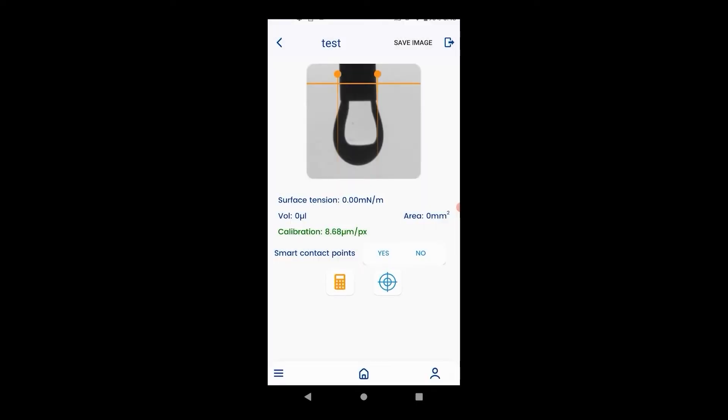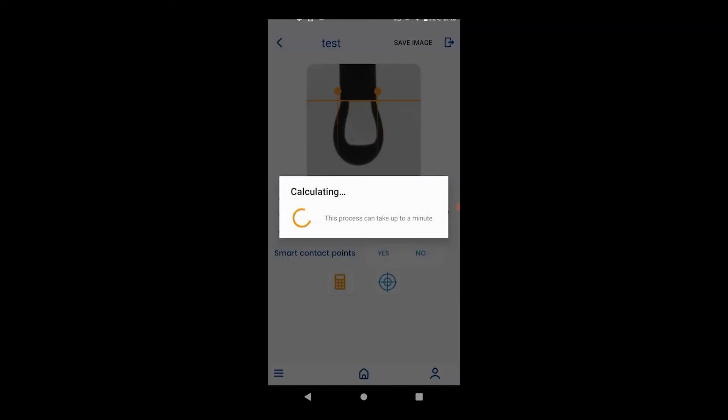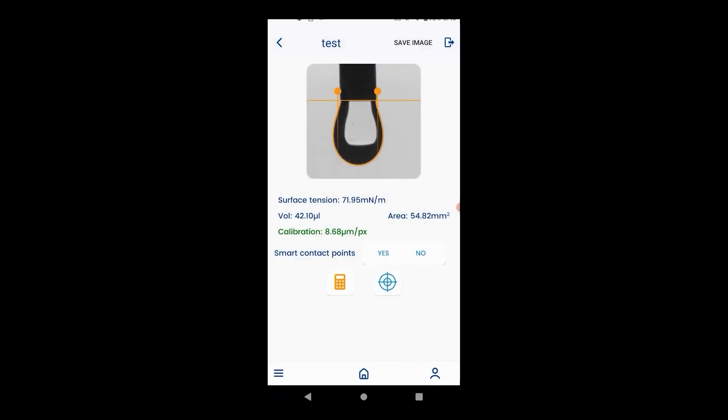Generally, the lower the calibration number, the better. Now, move the orange vertical bar to where the droplet meets the needle and the two points to both sides of the droplet and hit calculate. This will give you the surface tension, the volume, and the cross-sectional area. Now we will demonstrate how to use multi-capture for dynamic surface tension measurement.